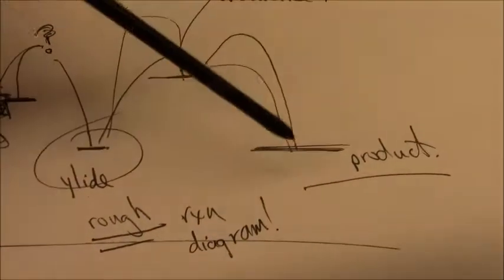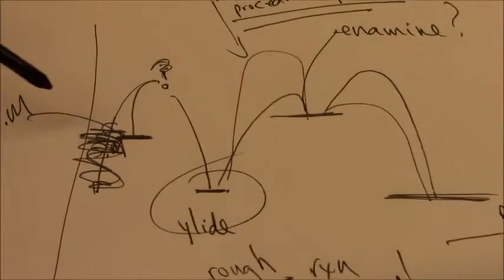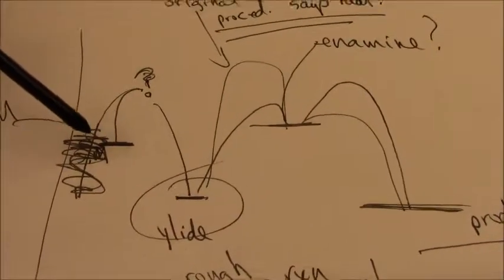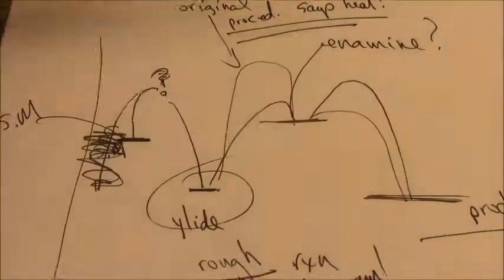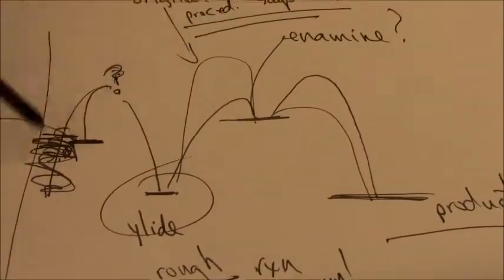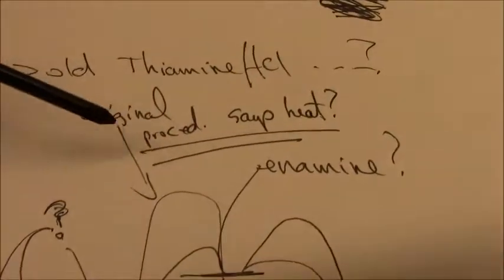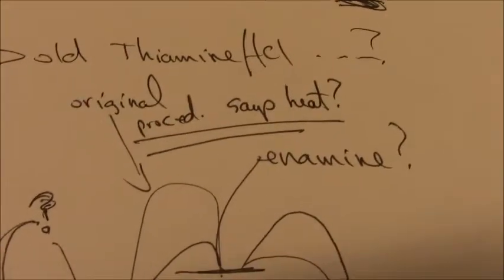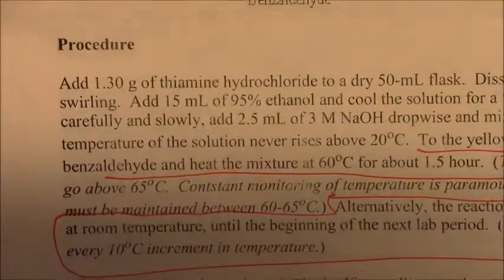Now, whether the overall reaction, I'm pretty much thinking the overall reaction start to finish is probably exothermic, only because whatever's happening up front is quite warm. And second to that, the original prep used to say heat, and I'll point to it right now. One of the original preps we used to use was this.